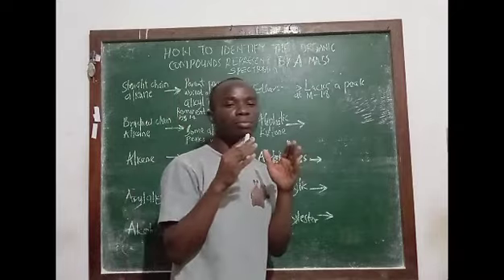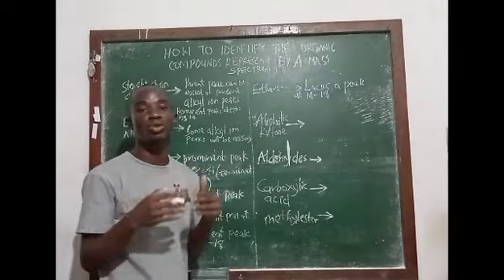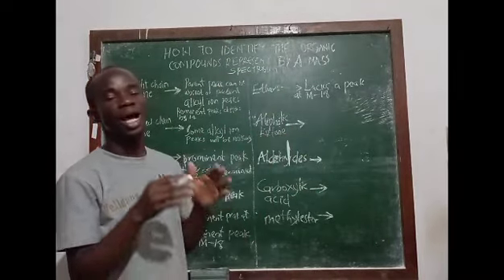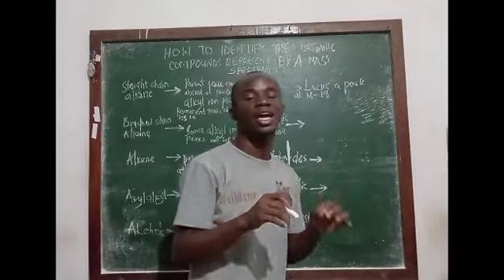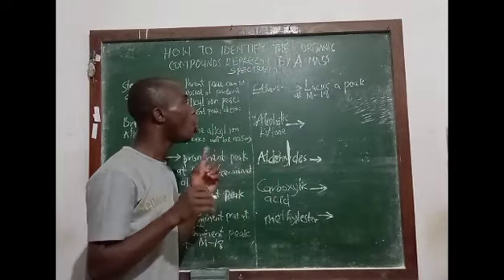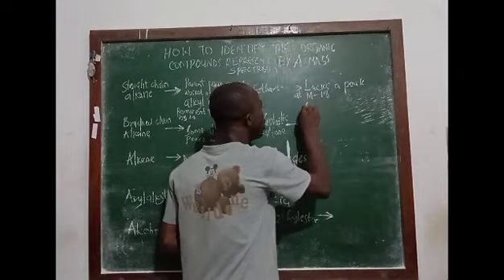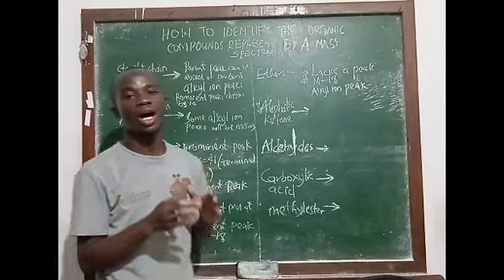Even though the mass spectrum of ether and that of alcohol look similar, yet a mass spectrum that represents an ether will not have an M minus 18 peak. Also, in an ether mass spectrum, alkyl ion peaks are prominent.